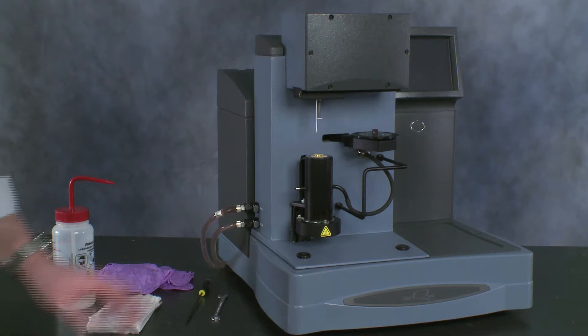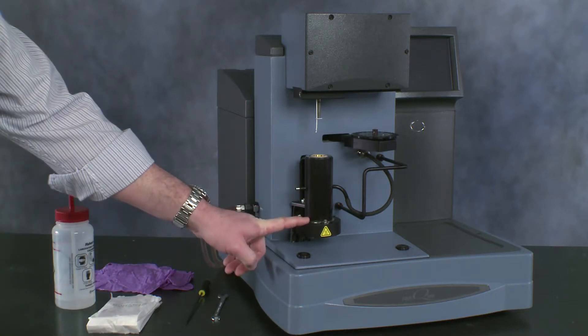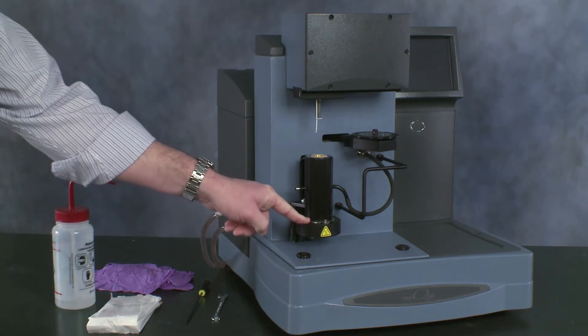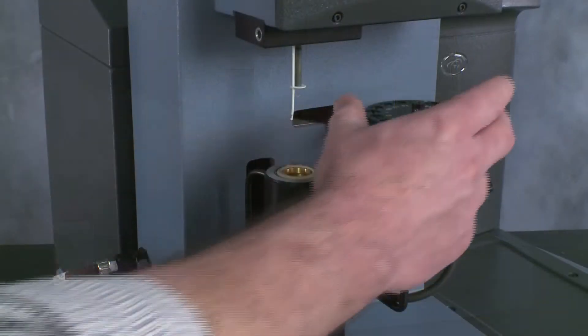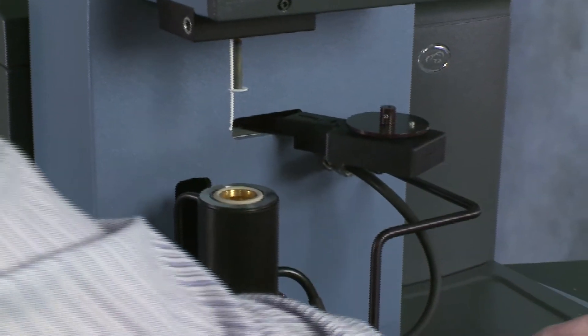When we're cleaning the furnace, the first thing we want to do is lower the furnace to its lowest position and turn the power off to the TGA. We may also want to remove the auto-sampler tray to help with access.